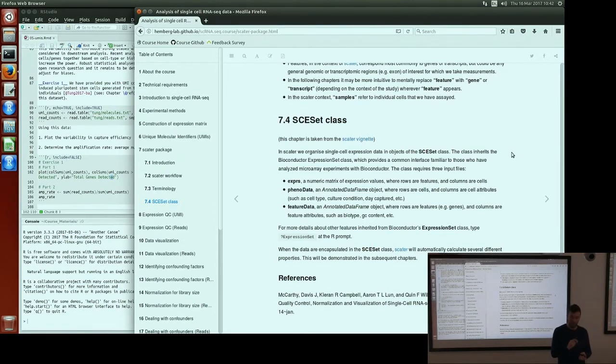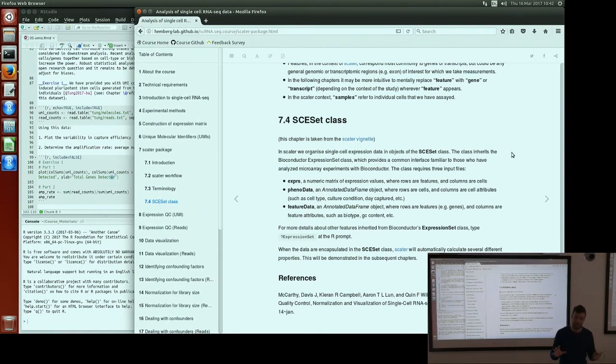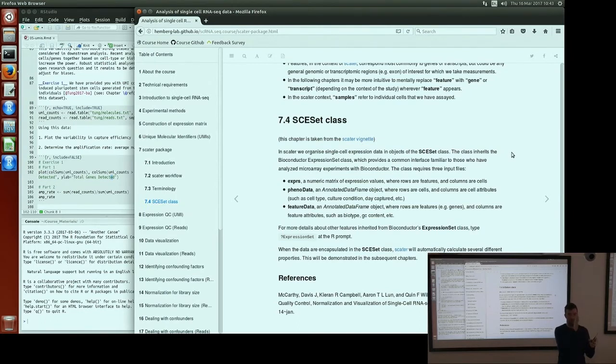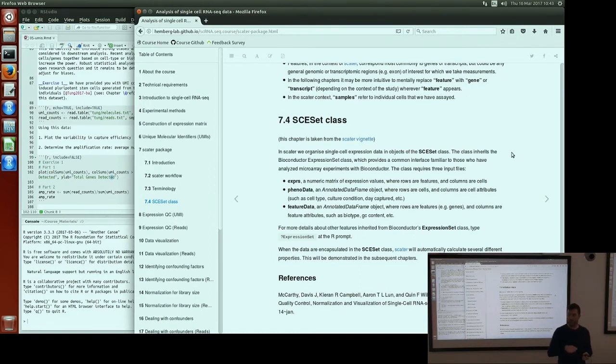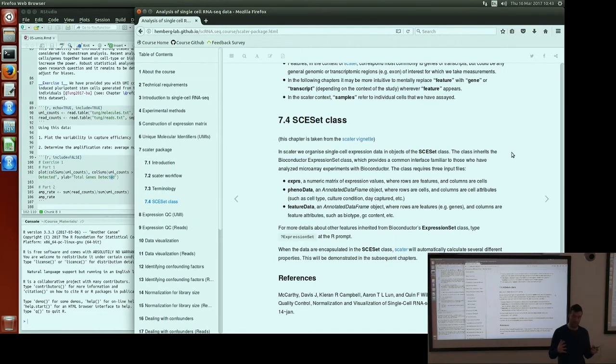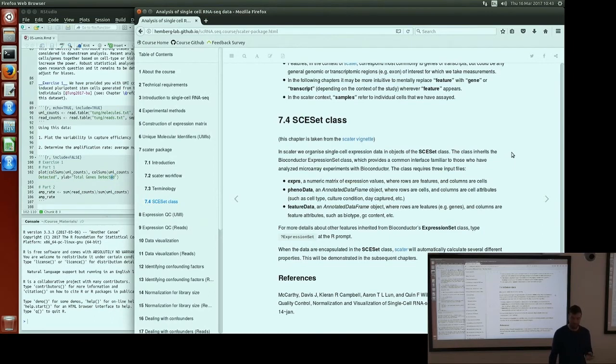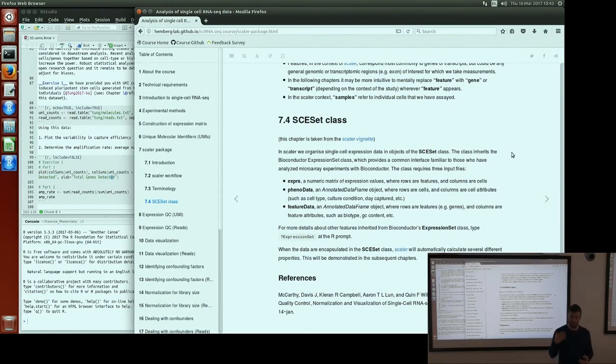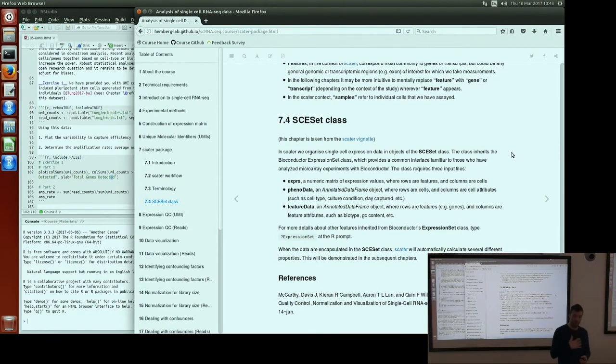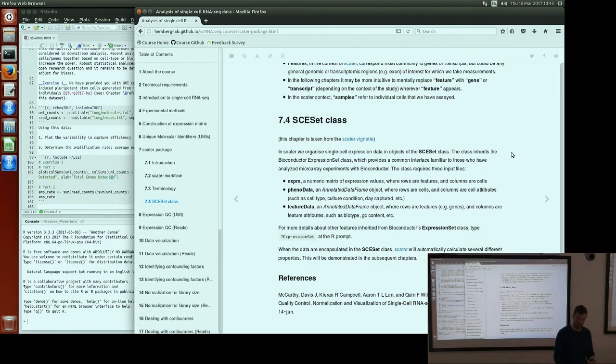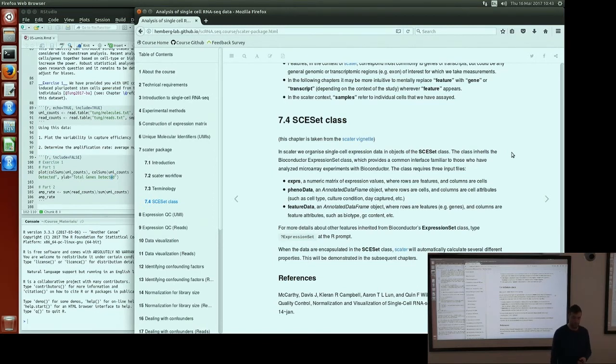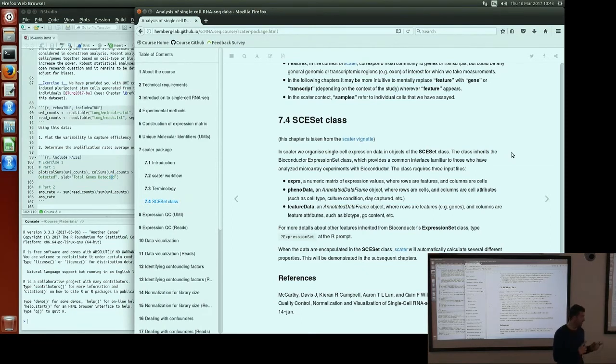We have phenodata, which is the cell level metadata—basically a matrix or data frame where the rows represent cells and the different columns represent different variables we've measured on those cells, like experimental condition or QC metrics. The feature data is the data frame giving information about the genes. There's a lot more stuff we can add at various different points in analyses, but that's the crux of it. So the first step, once we've obtained an expression matrix, is to build this SCESet object, which we can do in a couple of lines of code, and then apply the methods to do our QC. The next step is actually using this framework to do QC on UMI data, and for that I'll pass over to Vlad. But before I do, are there any questions?